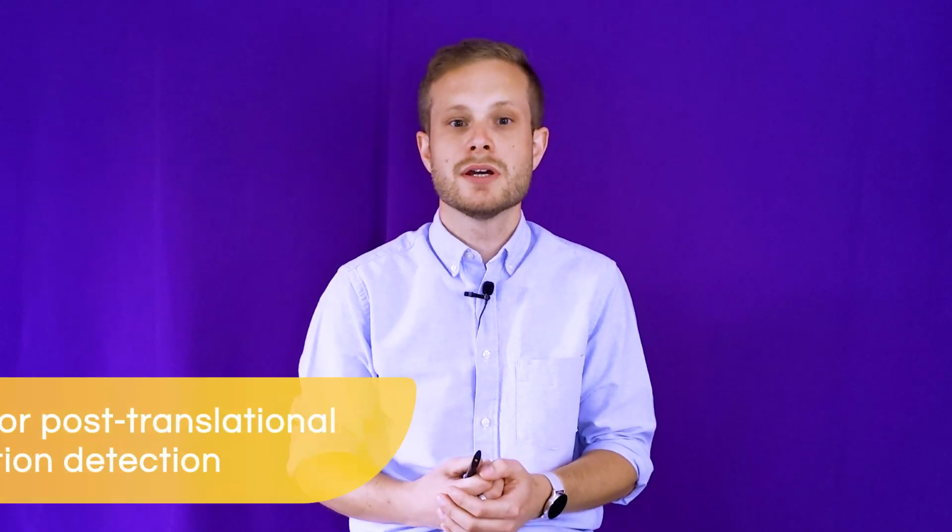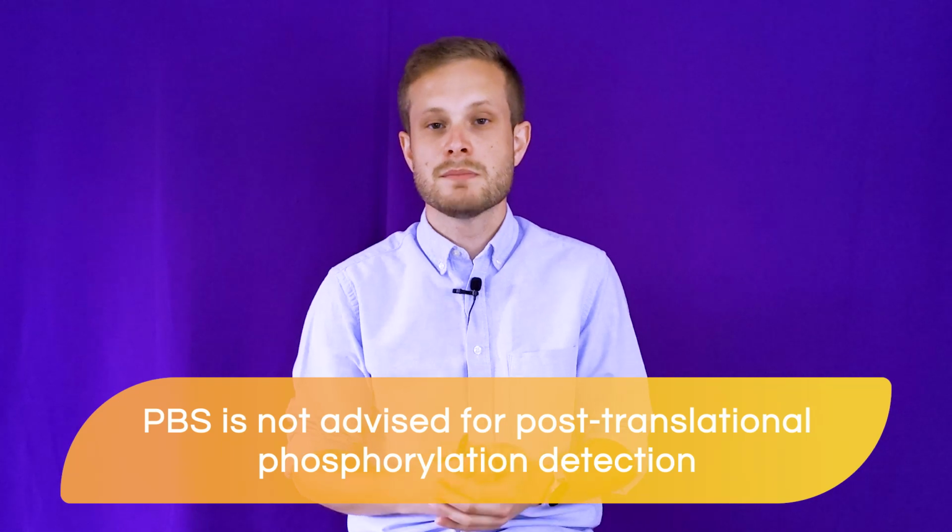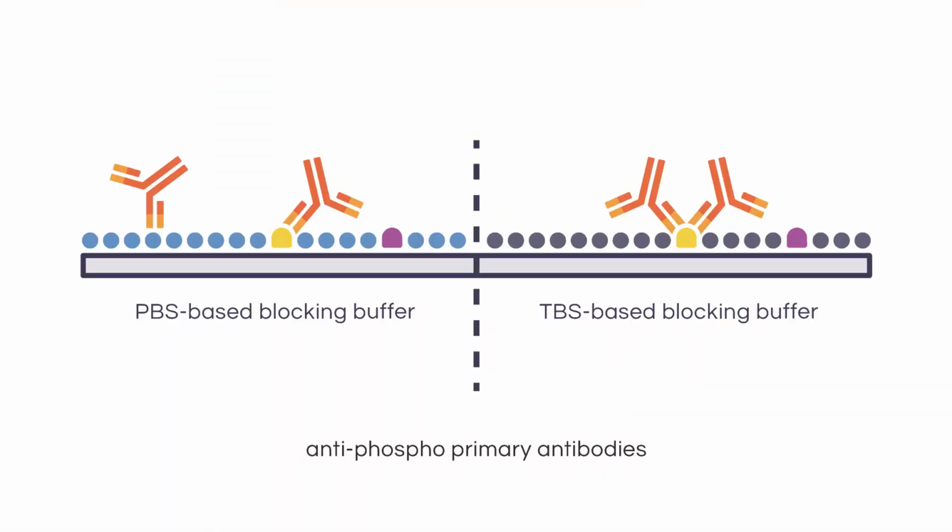Generally speaking, most antibodies are QC'd in TBS. And additionally, it is important to know that PBS-based solutions are not recommended when you are investigating post-translational phosphorylation of a protein. In this case, the anti-phospho primary antibody may competitively bind not only to the phosphate groups on the target protein, but also to those present in the PBS-based buffer, and this can significantly reduce the target-specific signal. TBS-based buffers are therefore recommended for any detection of post-translational phosphorylations.